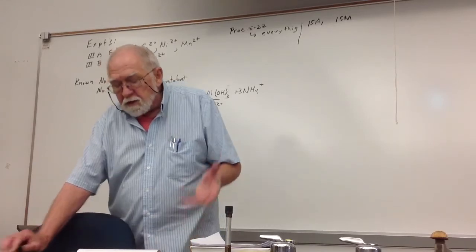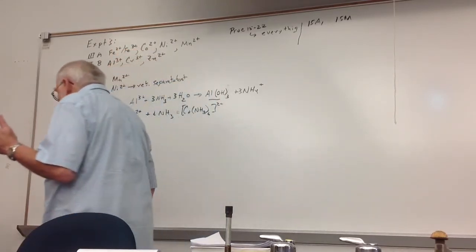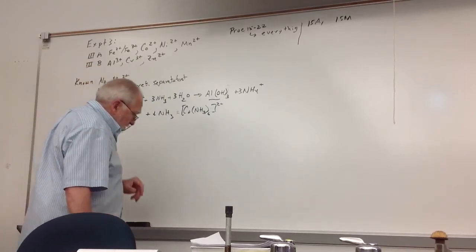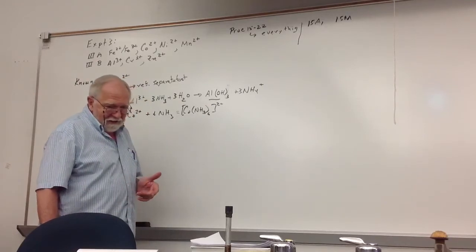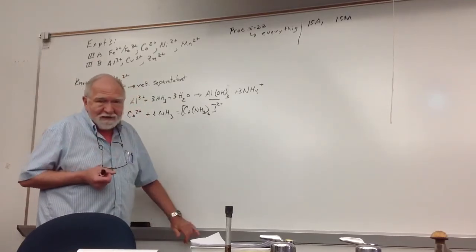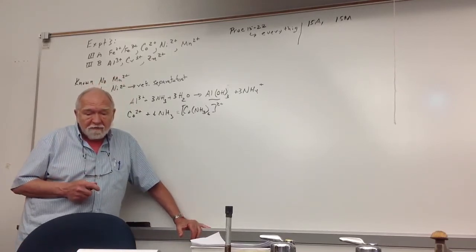But you want to look at your solutions because as you're making these precipitates, they'll form in different orders. You'll see different colors. People always say, hey, my partner and I were working together, they got this color and I got this color. What does it mean? It doesn't really mean anything. You just added different concentrations or different rates and different things precipitated out first.